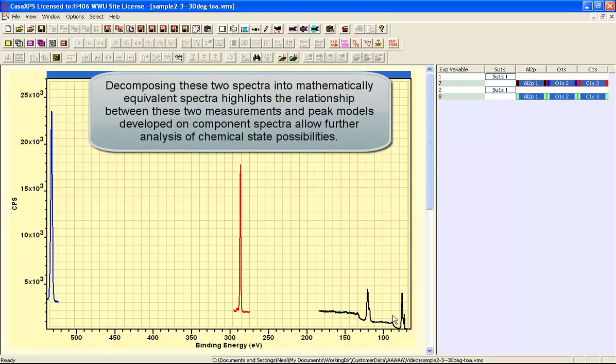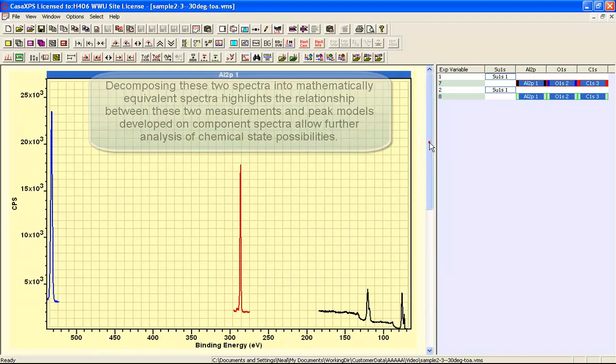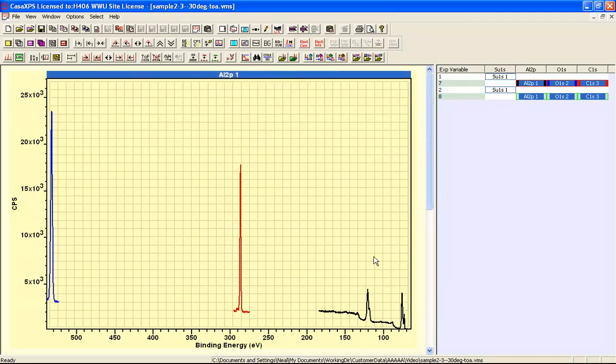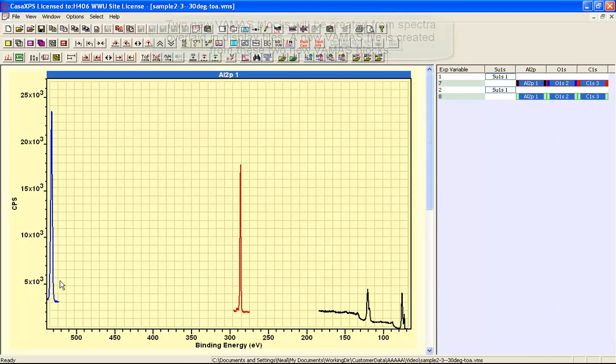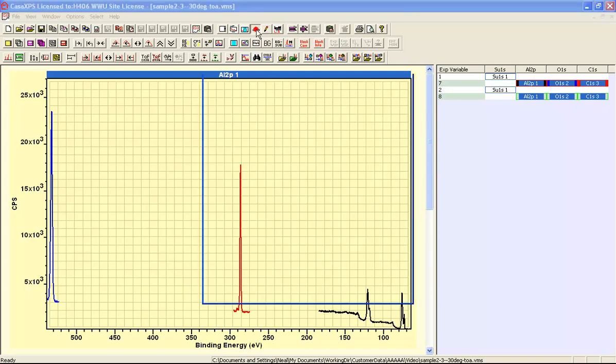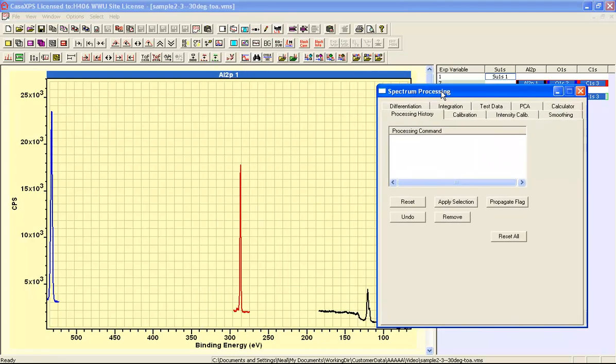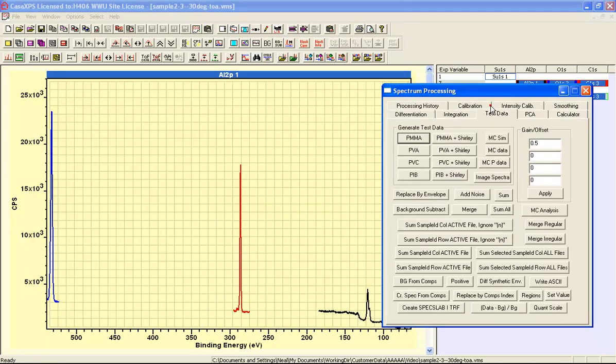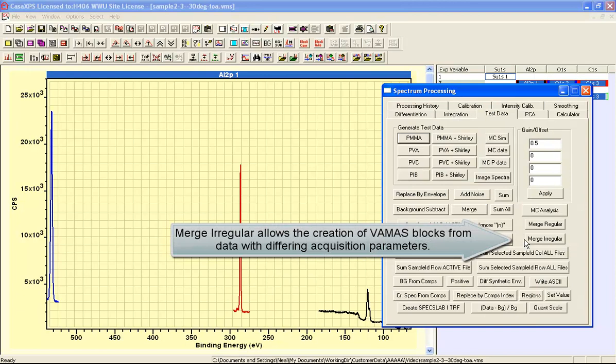So we overlay in each one of these display tiles a row of VAMAS blocks and these represent data that were acquired from the same sample. They are not necessarily acquired using the same conditions. For example, the energy step size for these aluminium data is not the same as the energy step size for the oxygen. So this is a set of data that will require an irregular dataset form in the VAMAS format.